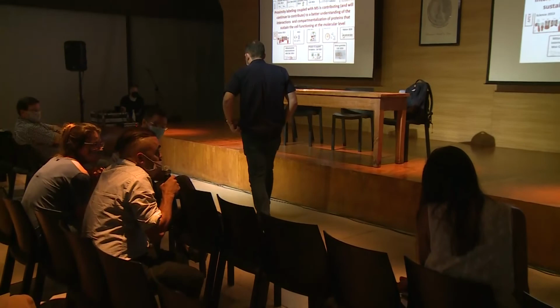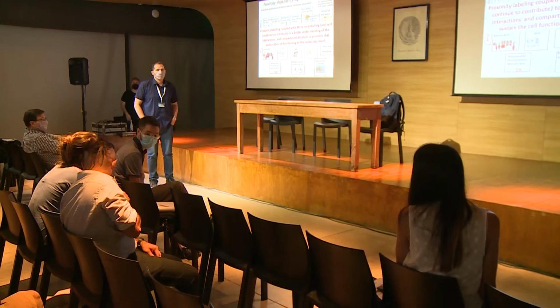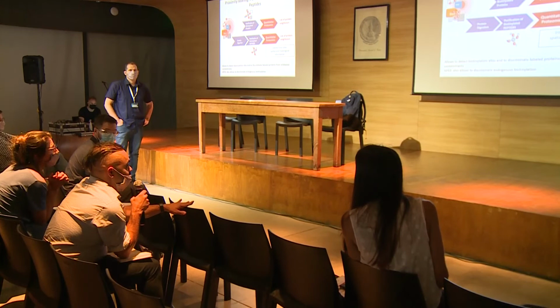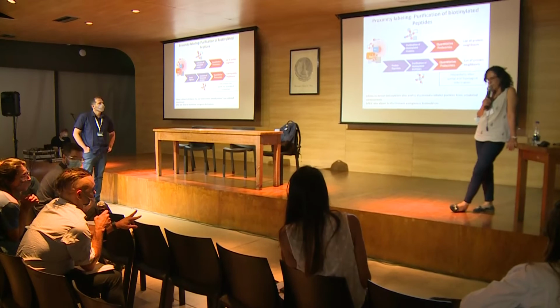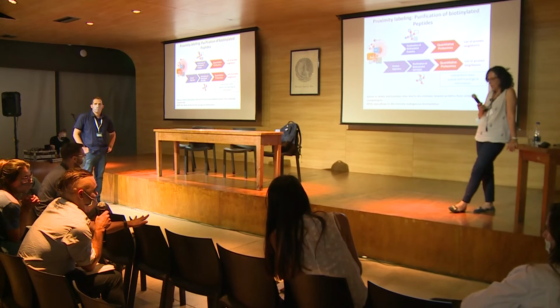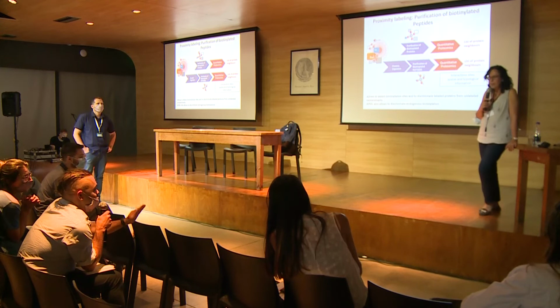Rosario, many thanks for the talk. I have three questions regarding the comparison between BioID and APEX. The first one is, in BioID, you use ATP as a substrate. So is this a risk when I'm thinking of plant cells, when the system has a different energetic status, if you're comparing, for example, an AMPK mutant or some type of cell that has a different energetic status, and ATP is the substrate? Could you have one type of cells more prone to generate the biotin ligase activity or something like that? This is the first question.